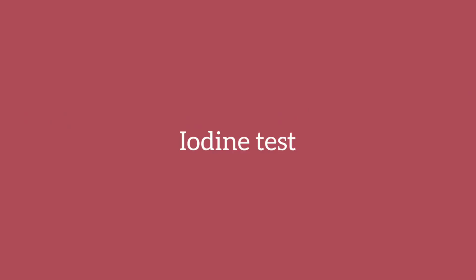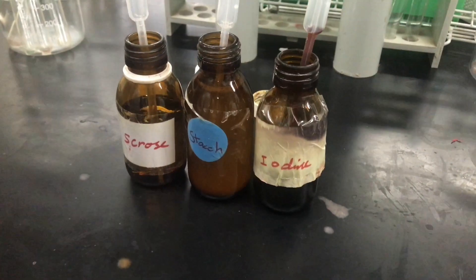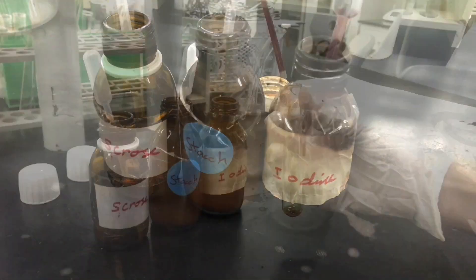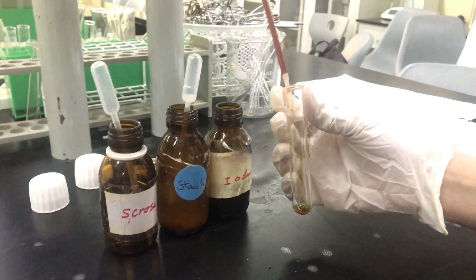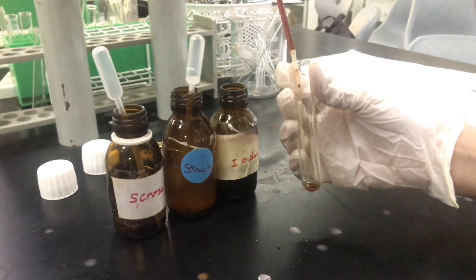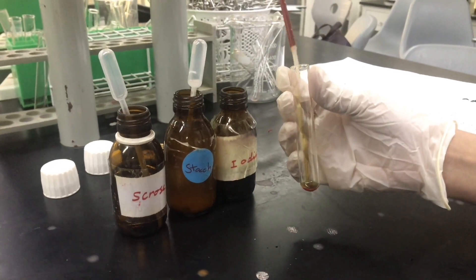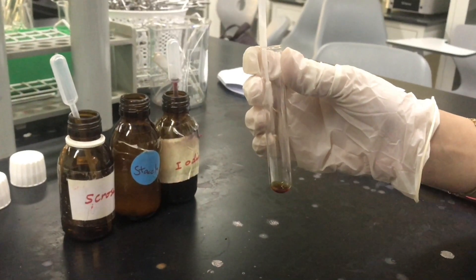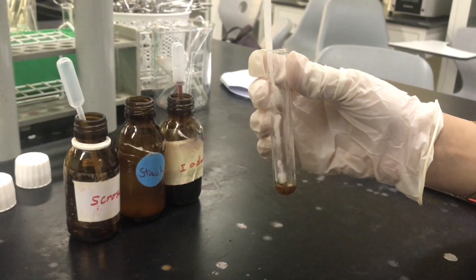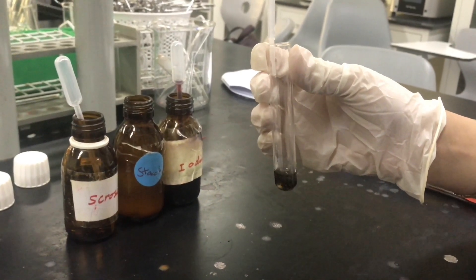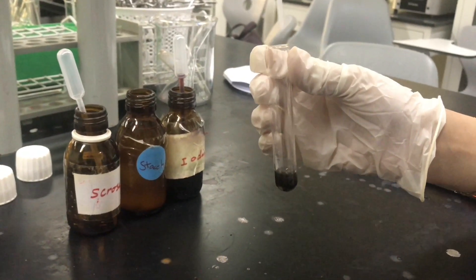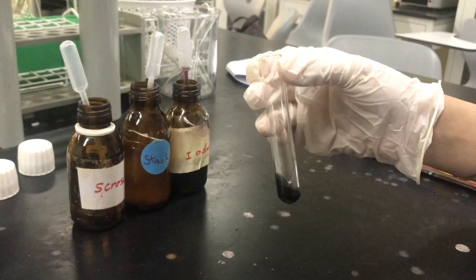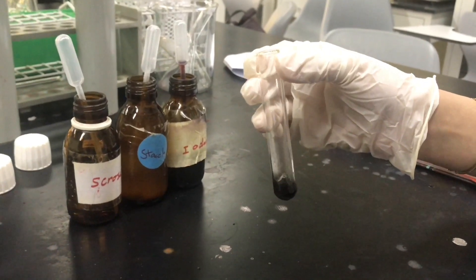Moving to the iodine test, which is going to show us the presence of starch. Add a few drops of iodine solution to the test tube, then add one mil of the sample solution. If it is starch, you are going to see an immediate change of color to a deep blue or black color.